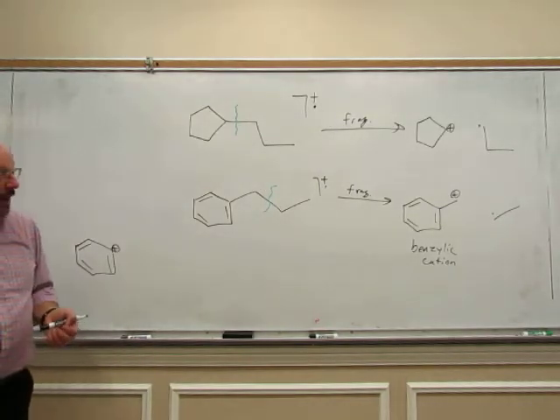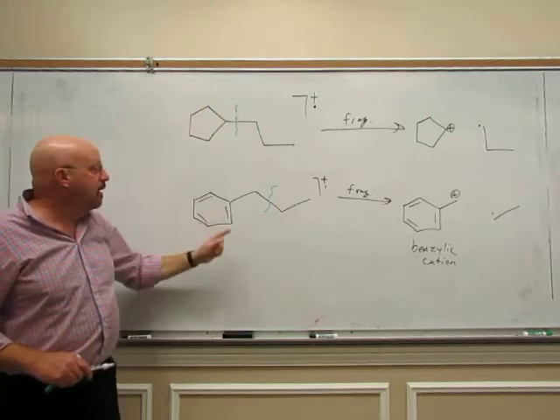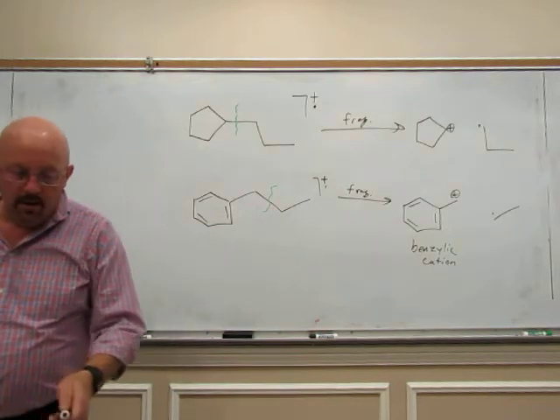Okay, so that's how rings like to do. Most rings, we want to cleave right next to it. Phenyl rings, you want to go one carbon and then cleave. Questions?